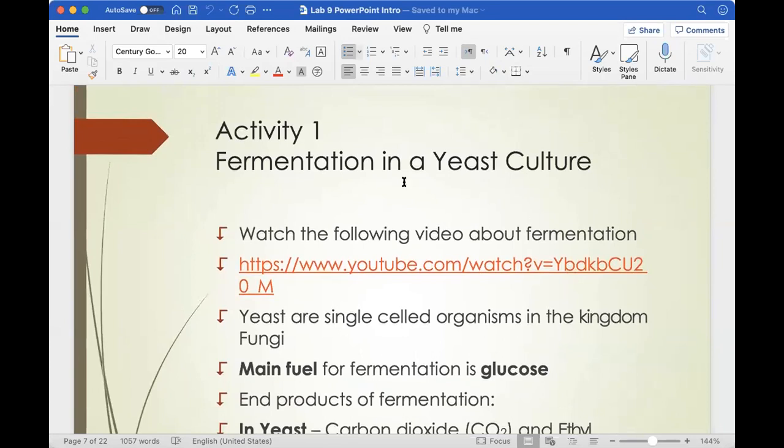So for activity 1, they'll take you through this process of fermentation in a yeast culture. Watch this video about fermentation. It's by the Amoeba Sisters.